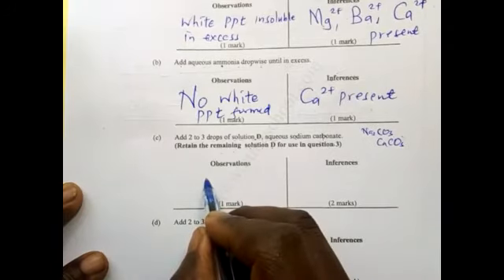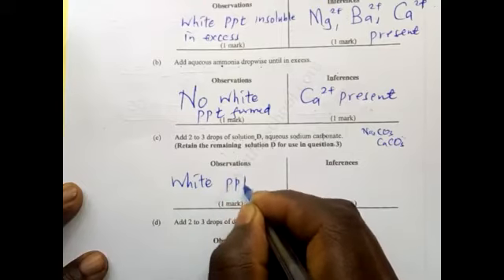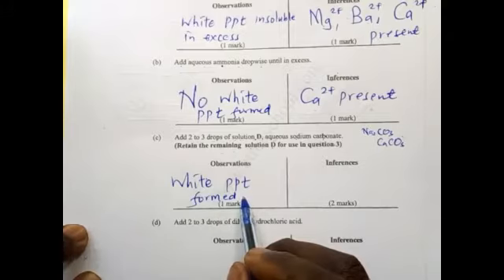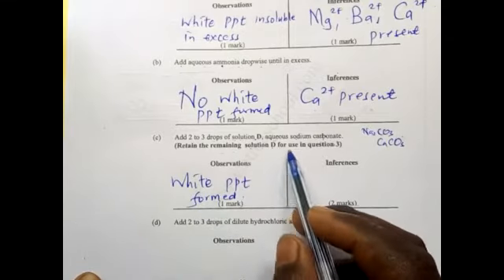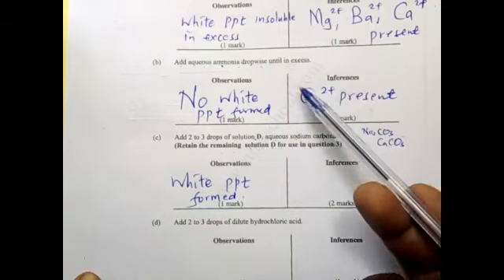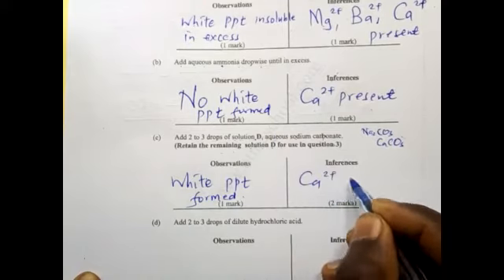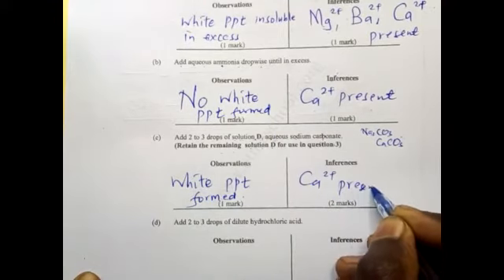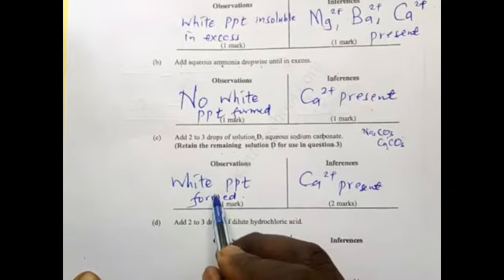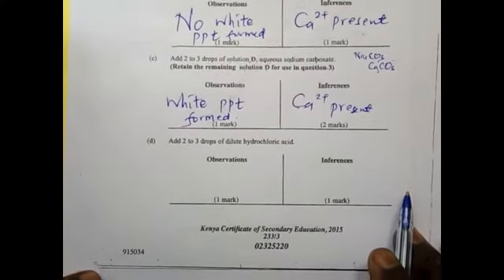So here, what was the observation? White PPT. If a white PPT is formed and there is no effervescence, actually there is no acid, because we have not said there was an acid. So here we are going to just repeat that calcium 2 positive is present, because the carbonate will form calcium carbonate, which is a white precipitate. That is the knowledge we are talking about.